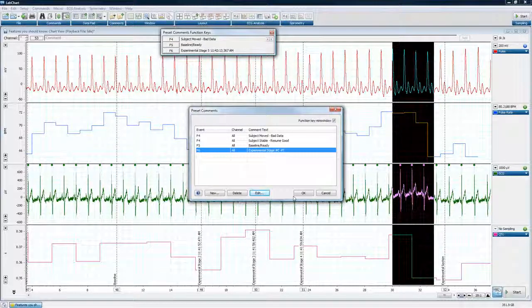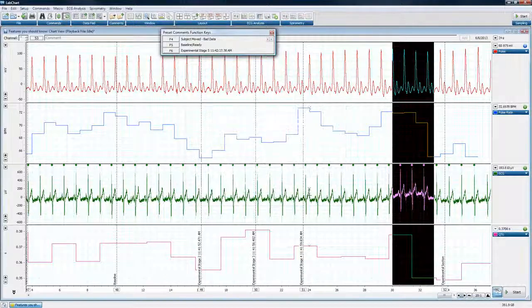Now, finally, there's just a couple more things that I had on the list, okay? And these are a couple of things that people almost never know about unless they've been to a course or they've had somebody teach it to them specifically. And this one I just learned about literally weeks ago.